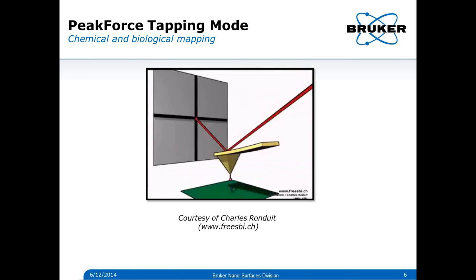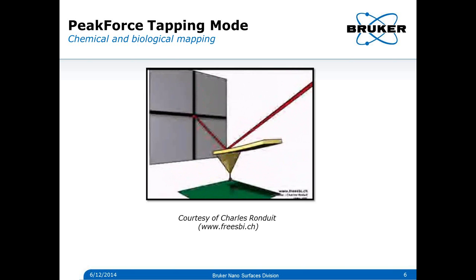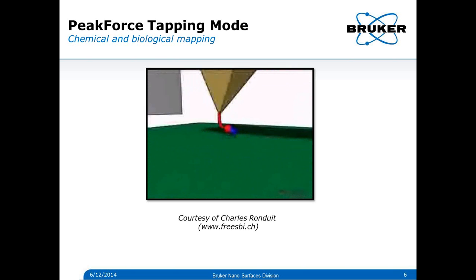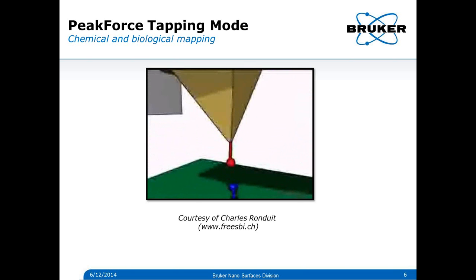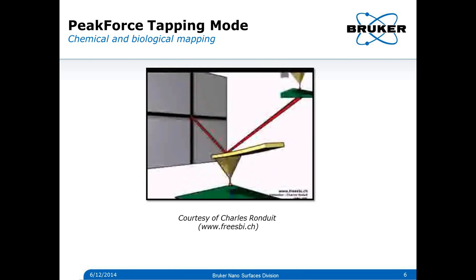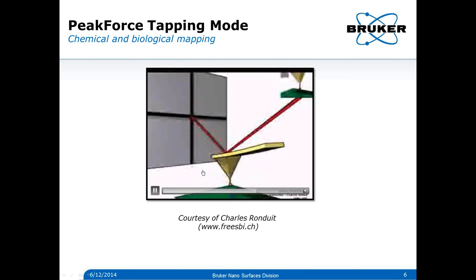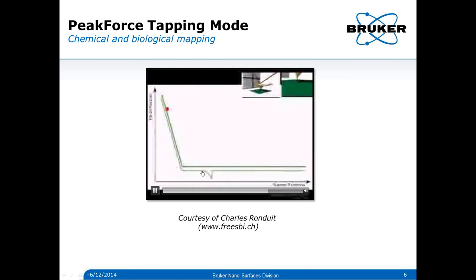It also introduces a characteristic curved adhesion peak due to entropic stretching of the linker molecule, which helps distinguish the desired specific interaction from a non-specific interaction. In this animation, you can see the characteristic force curve with the specific interaction where the linker is used.